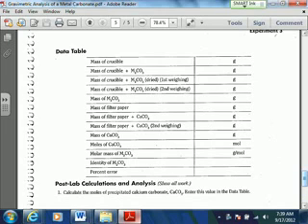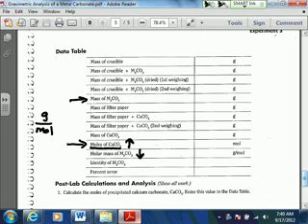Okay. So for example here, the molar mass is the grams of M2CO3 divided by essentially the moles of CaCO3, since it's a 1-to-1 ratio there. So anything that you can think of that would make this number, the moles of CaCO3, higher than it should be, is actually going to make your molar mass lower, because molar mass is grams divided by moles, right?